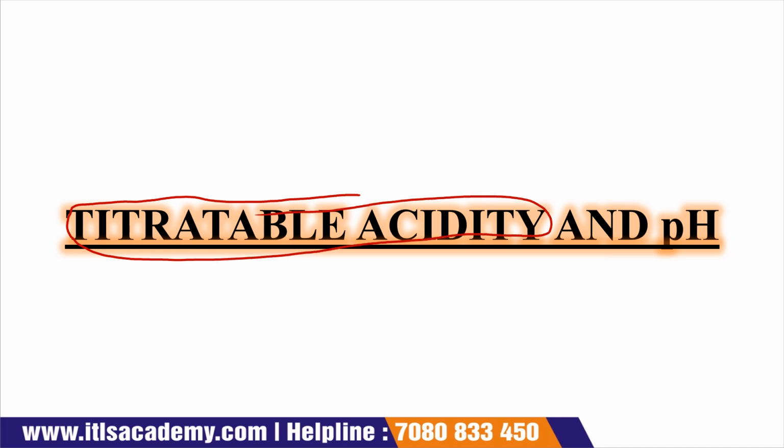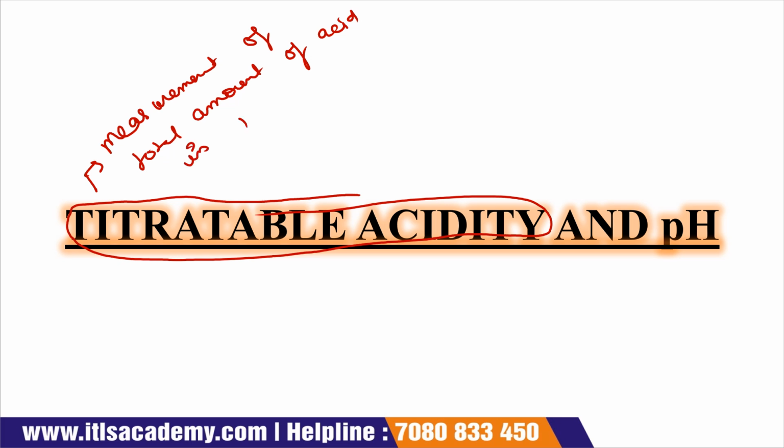Titratable acidity is the measurement of the total amount of acid in solution, and this acid can react with a strong base and be neutralized.